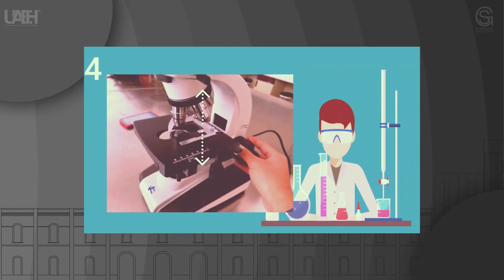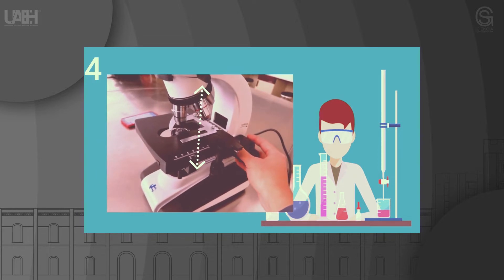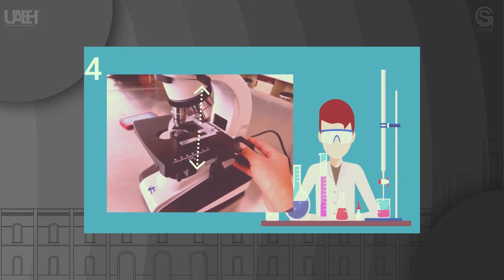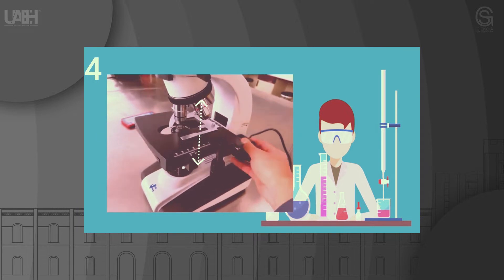Step 4: Without looking through the eyepiece yet, adjust the coarse screw to bring the stage closer to the objective. Try to get the sample as close to the target as possible but avoid touching each other, as this could damage the sample and the objective.